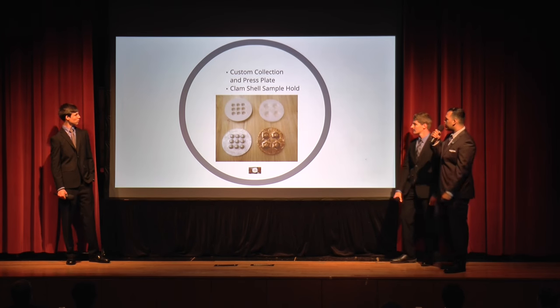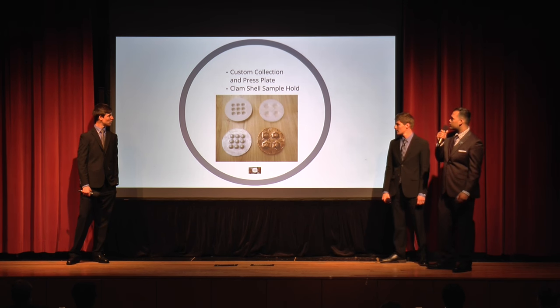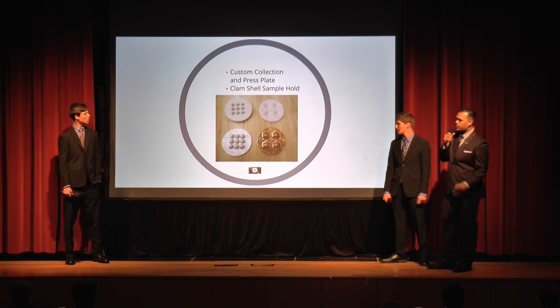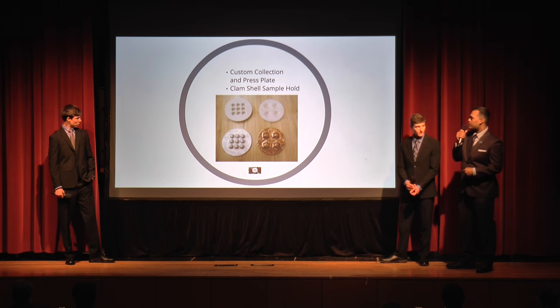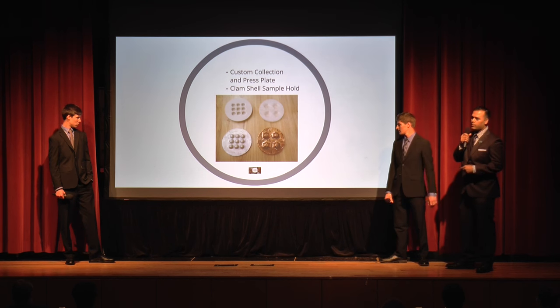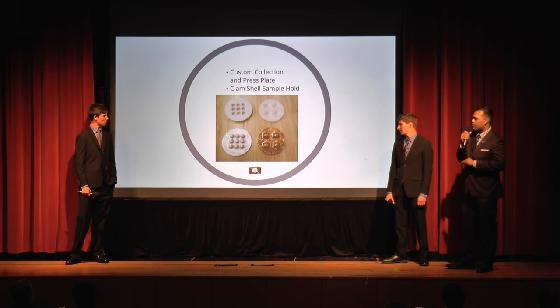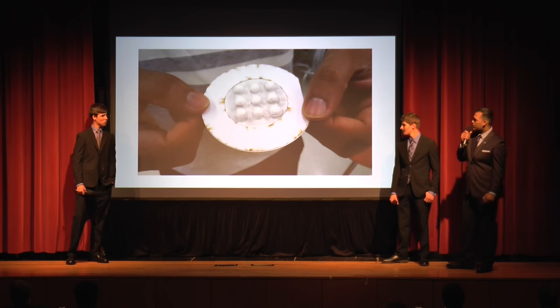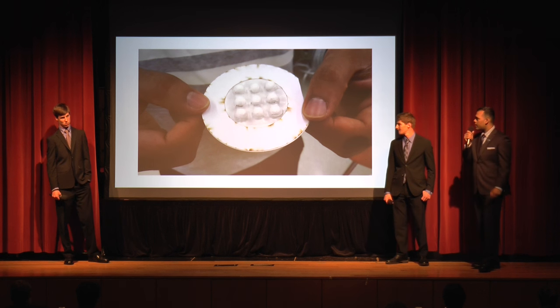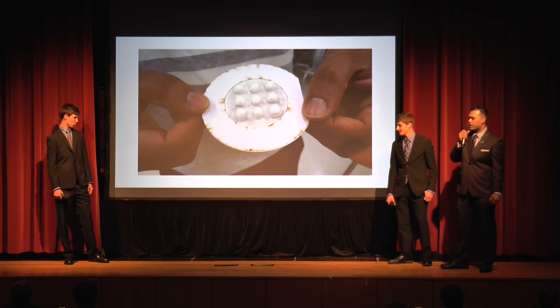After realizing that shape has tremendous effects on sound, we developed a custom collection plate. And with the custom collection plate, we spun nanofibers on top of it. After that, we also made a press plate to press down the nanofibers while we were spinning, so the nanofibers will coat the custom collection plate perfectly. We also made a clamshell to remove the nanofibers from the top of the custom collection plate and perfectly fit it inside the impedance tube to test the nanofibers.